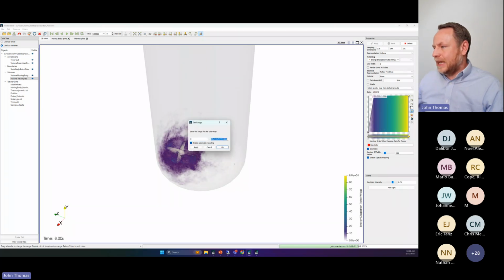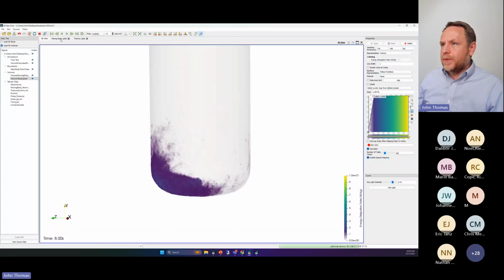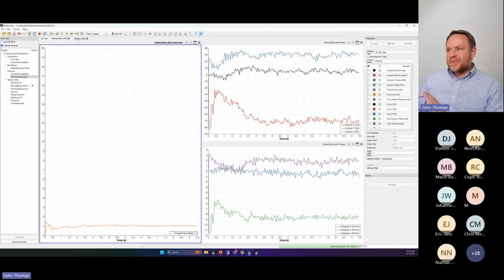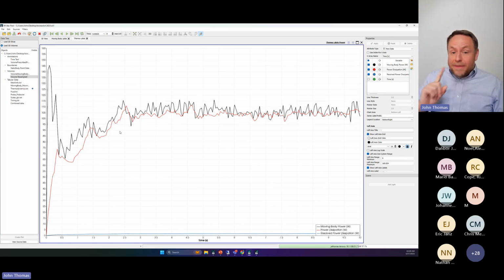The EDR is rocking around the impeller and it gets lower in the far field. We're then adding up the EDR everywhere. And as expected and demanded by the first law, these guys converge. We are not making them converge. We are not telling EDR, oh, hey, this is the impeller power number, you better match.